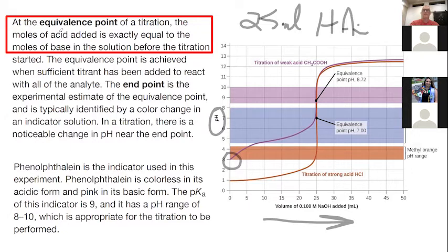And then the pH will change. It'll go up, but only slightly as we're adding more and more NaOH. You see it goes from 3 up to 5, up to 6. And then when the number of moles of acid and base are the same, that's called the equivalence point. That's when you have moles of acid equal moles of base. So right here for acetic acid.